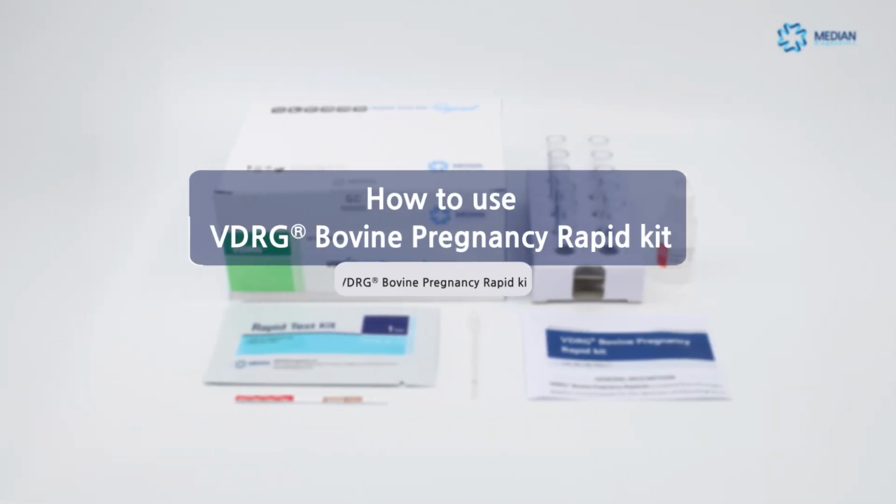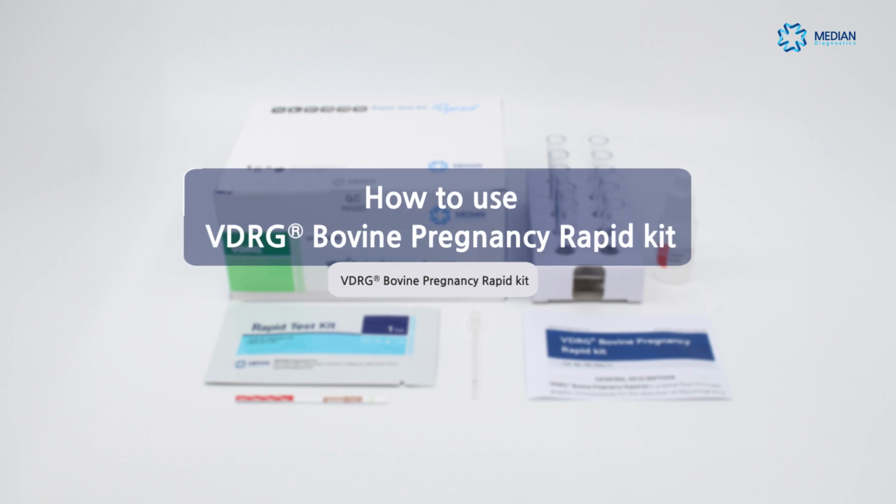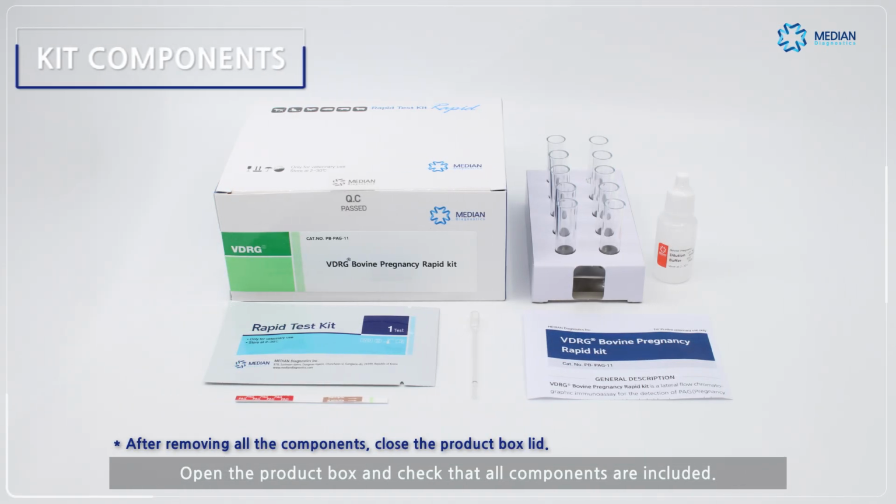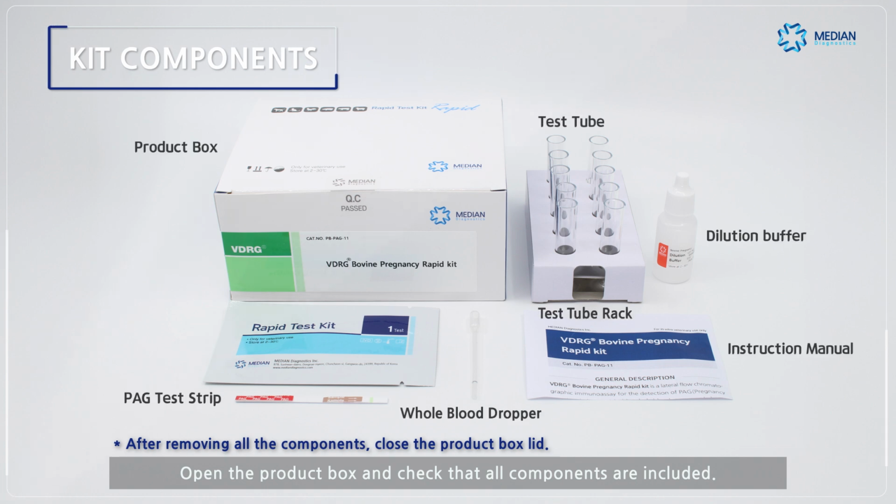Welcome. This video will guide you through the instructions for using the Bovine Pregnancy Rapid Kit. First, open the product box and check that all components are included.